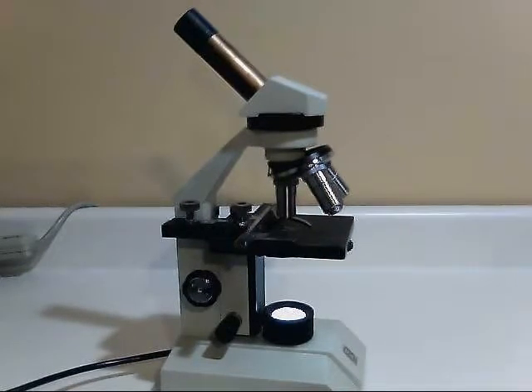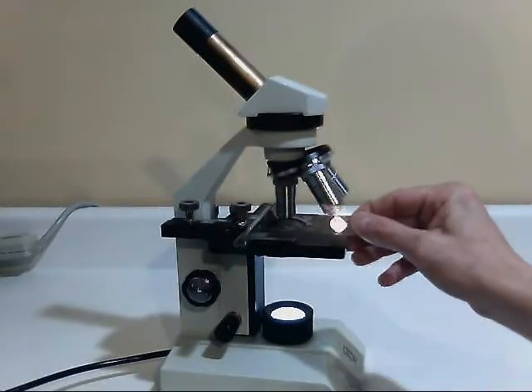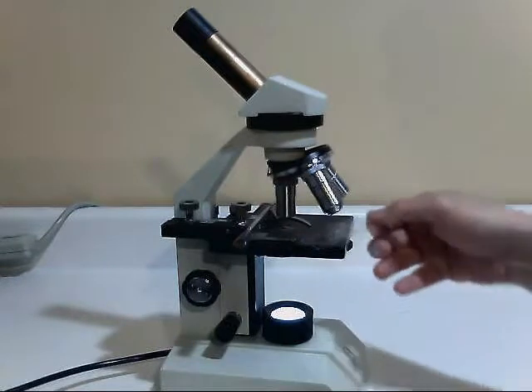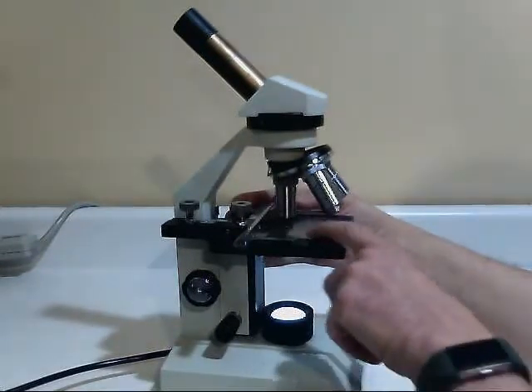Hi everybody, back again. We have our newsprint slide that we just made. And that little smudge of paper is right there in the middle of our glass slide. We're going to take that and place that on the stage.